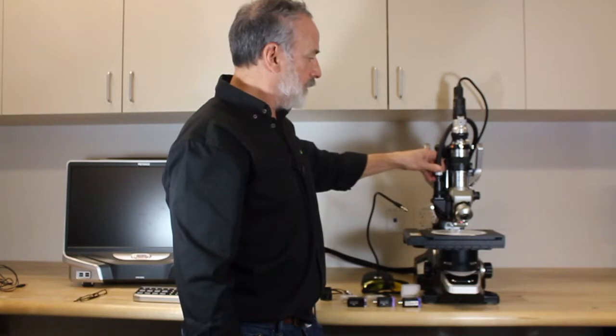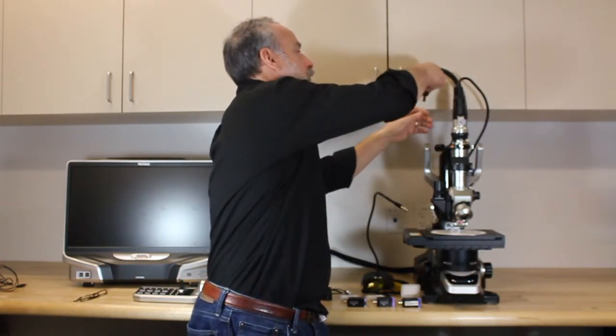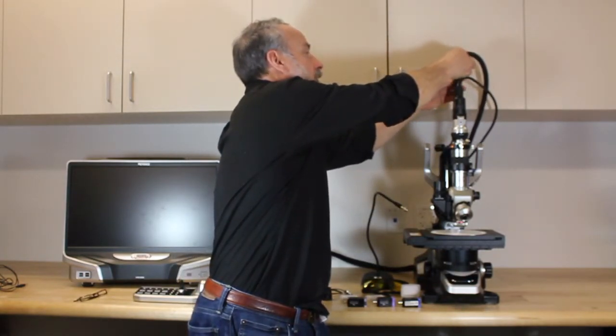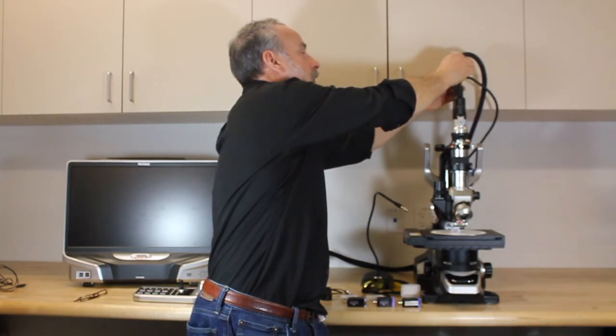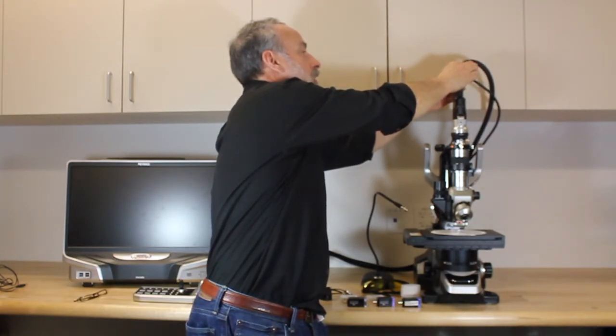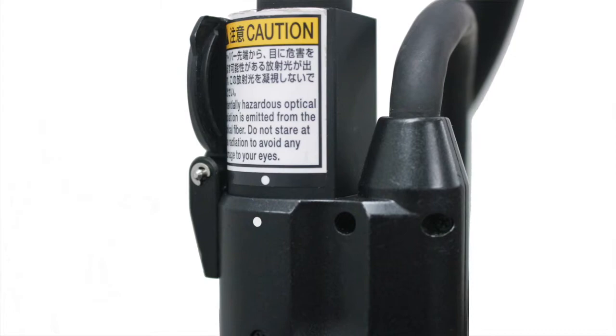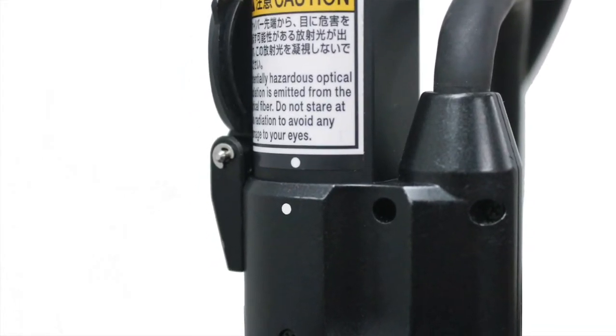We remove the Keyence fiber, lifting straight up, and we can park it out of the way at the slot up at the top. Just bring it up there, line up the white dots, put it in place, and that can live up there out of the way.